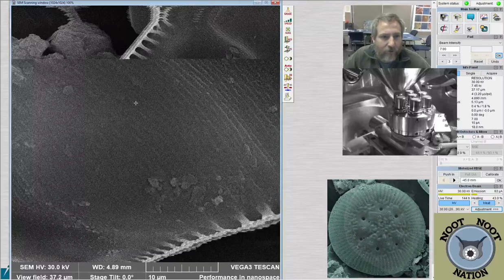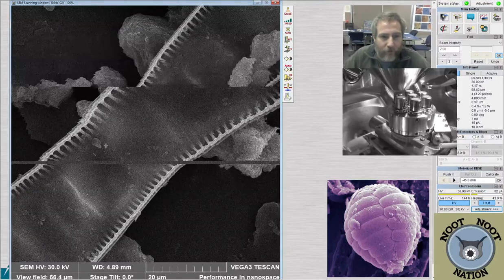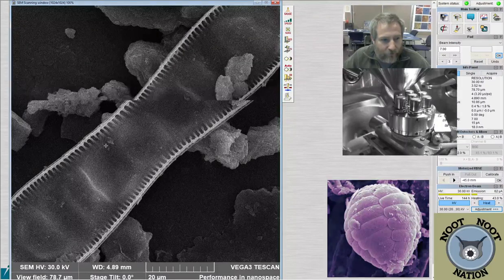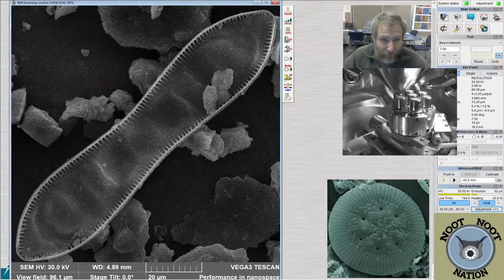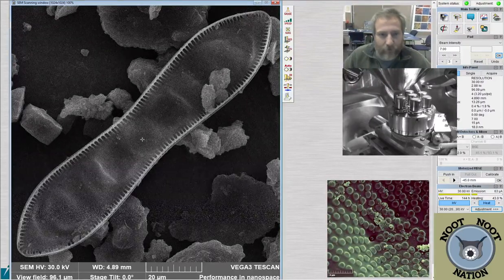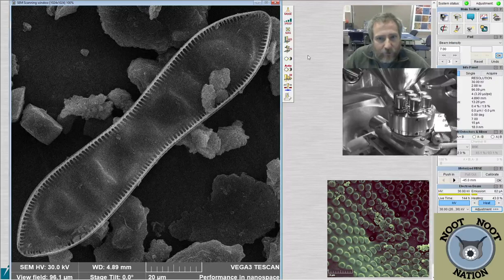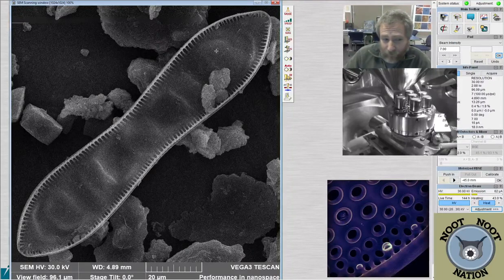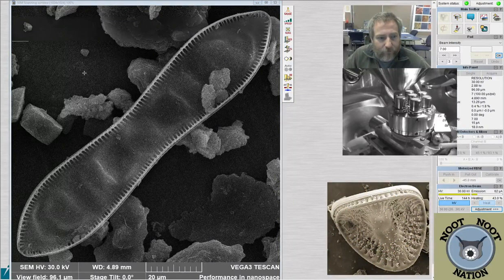We've imaged this diatom, or one very similar to it, previously from a number of different places. It's probably one of those diatoms that we think of as being cosmopolitan, which just means you can find it in a lot of places. You can find it anywhere. That's kind of what cosmopolitan means, but when we say cosmopolitan with respect to diatoms, we just mean that it's got a wide distribution. So they've seen this species in a lot of places. I don't know if it's exactly the same. It could just be something that's very closely related to it, but it's kind of common. And it's going to make for a nice picture for the poster.